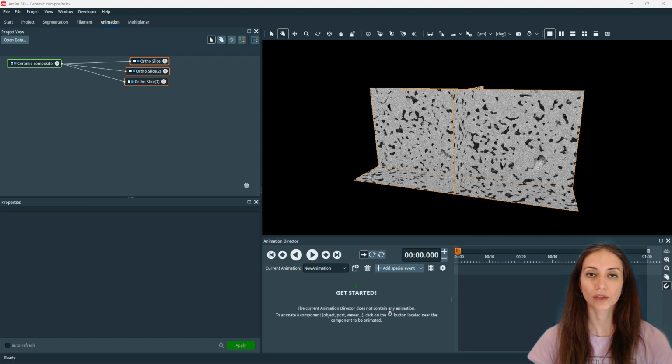I'm going to show you how to get started with animation in Amira-Avizo software.